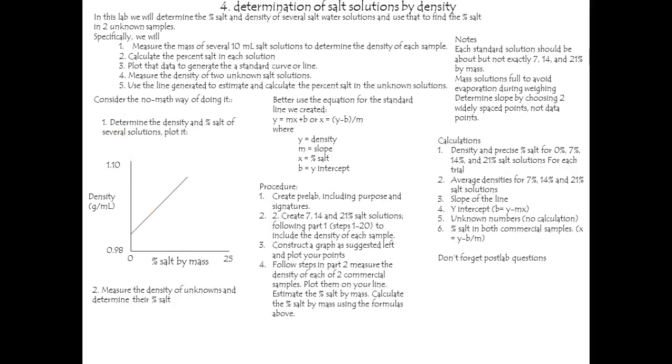I should point out that we won't be doing it by just drawing a line down and estimating, although we will estimate. We'll do it slightly more precisely by using the equation for a line to get a more precise x-intercept, if you will, for each of the unknown samples to get the percent salt by mass.